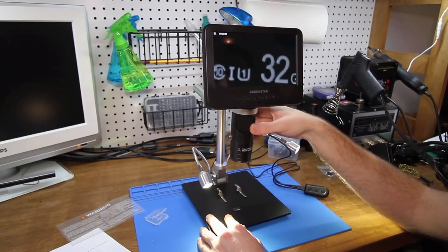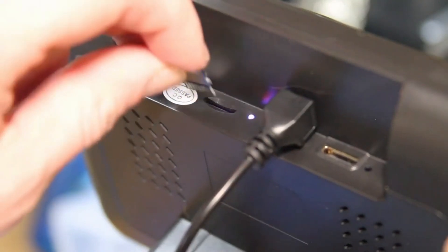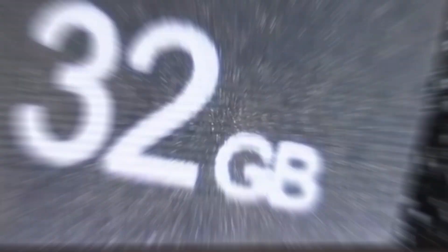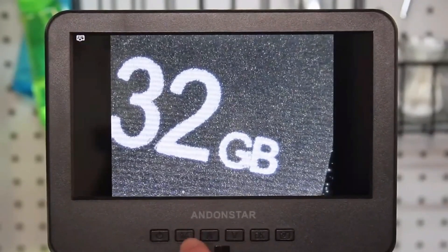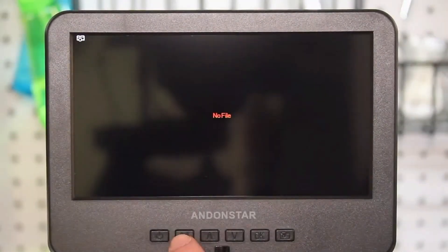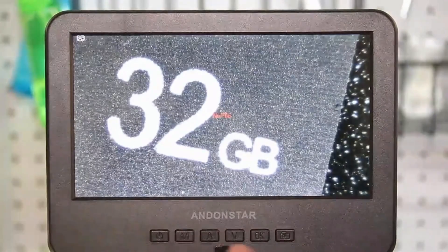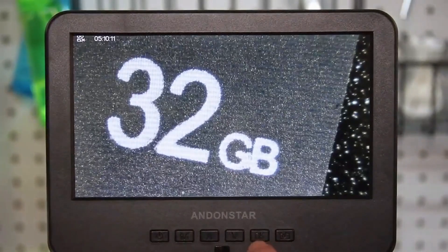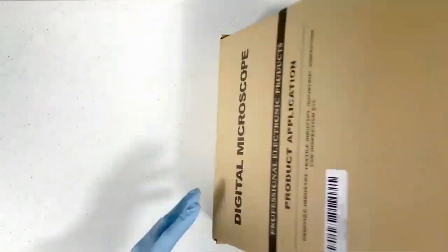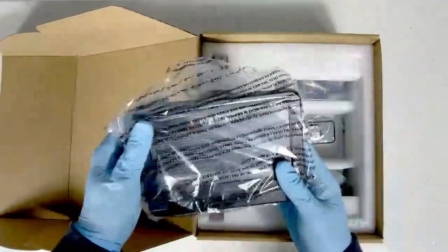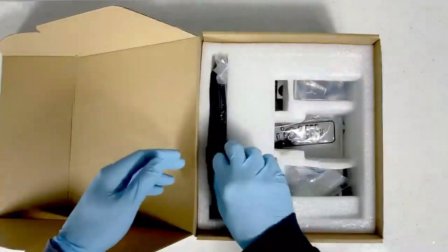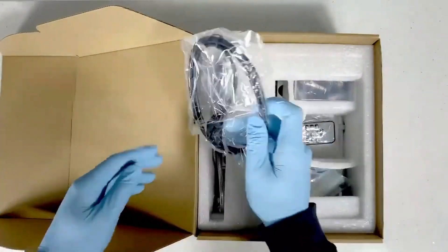Whether you're an adult or a kid, this microscope kit is a fantastic choice. With multiple lenses to fit your different needs, it functions as a soldering microscope, a coin microscope, and even a biological microscope. Plus, it comes with a variety of accessories, including biological slides, ensuring it meets the interests of both adults and children.